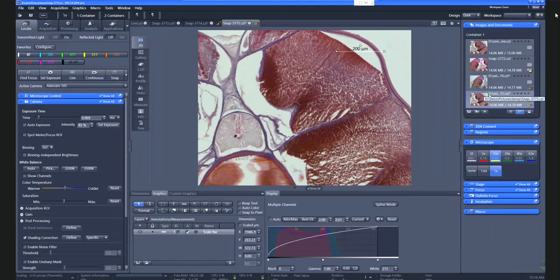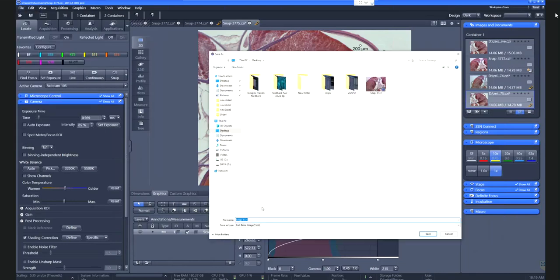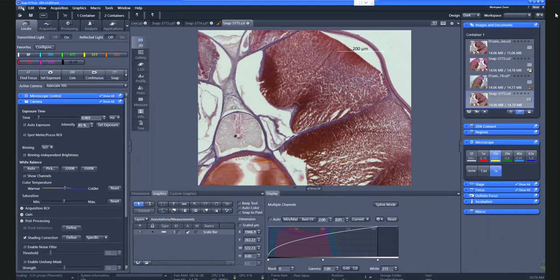And whenever you want to reopen that image, you are quite sure you're looking at and facing your raw data. No problem to export those data for your presentation, for your paper or whatever, but just to play safe, best to keep the raw data as well. If you want to save this, just save this as a CZI image file and no more requirements needed. You just save it and give it a certain name.